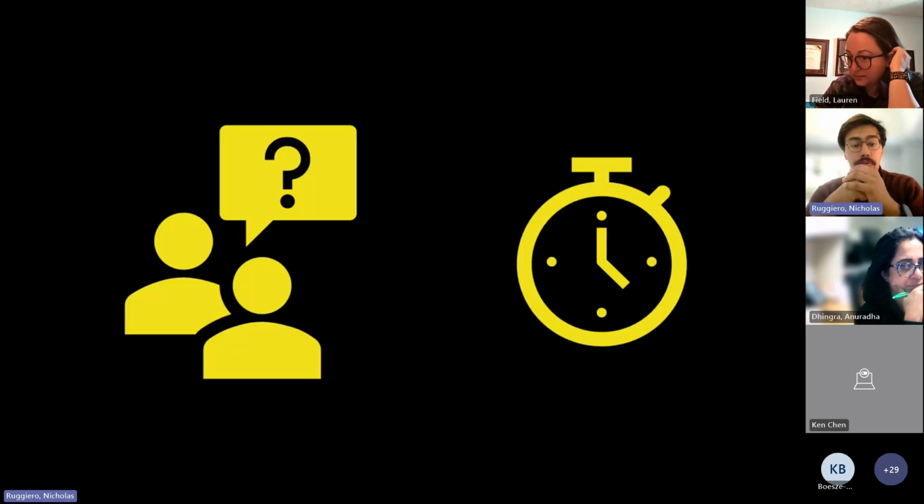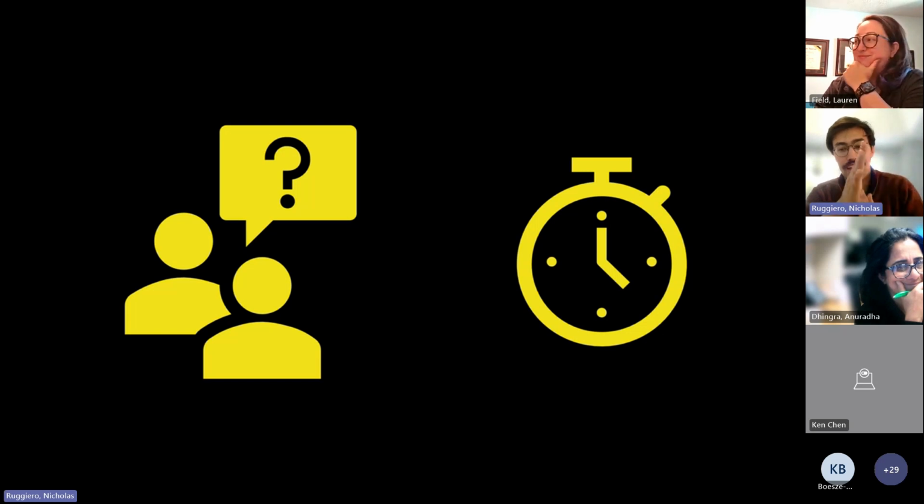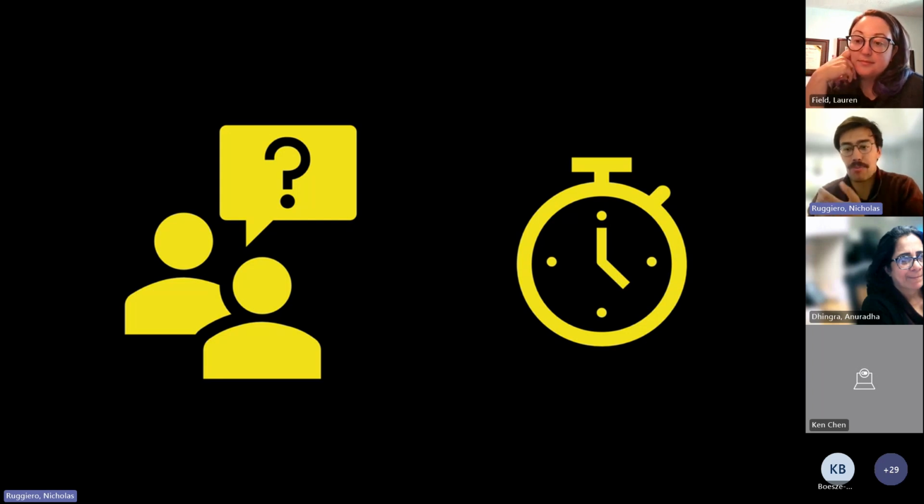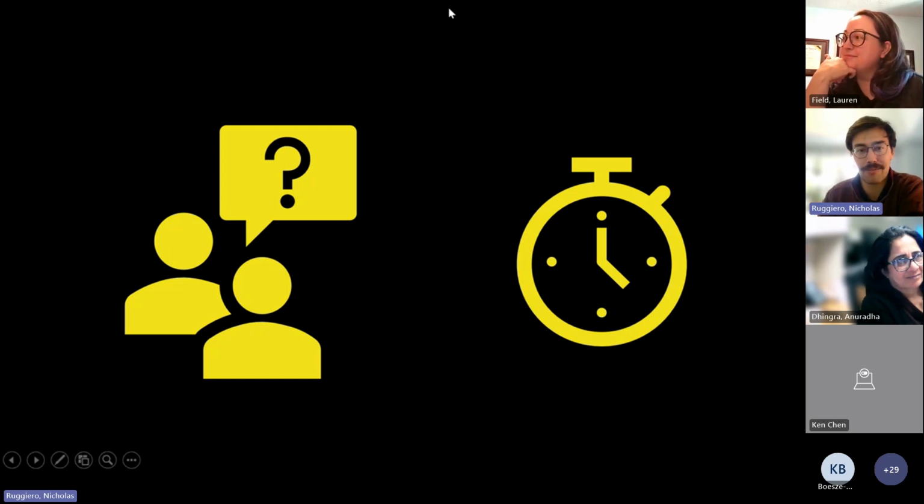Okay, that was the presentation. We did it. Congrats, you're all experts in GA3 and image processing. If anybody has any questions, now's a good time. We'll take a quick 5-minute break so I can swap over to my desktop computer. And if anybody has to go to the bathroom and grab a snack, now's a good time to do all that stuff.